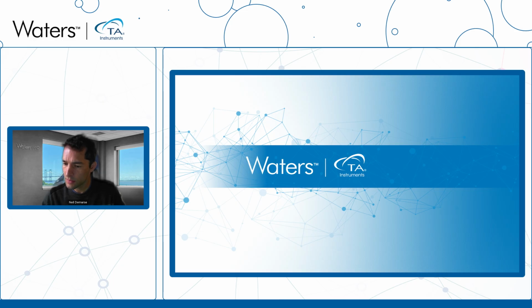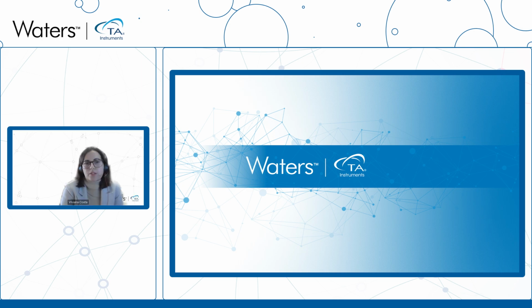Next question: will any of the sample chip prep be automated in the future? That's a very good question. Sample preparation for the RS-DSC is very simple. It does not take that much time to prepare a set of 24 microfluidic chips, but it does still take time. We want to improve the testing workflow, so it's something we are always looking to add in the future. We are definitely addressing including automation sometime in the future.